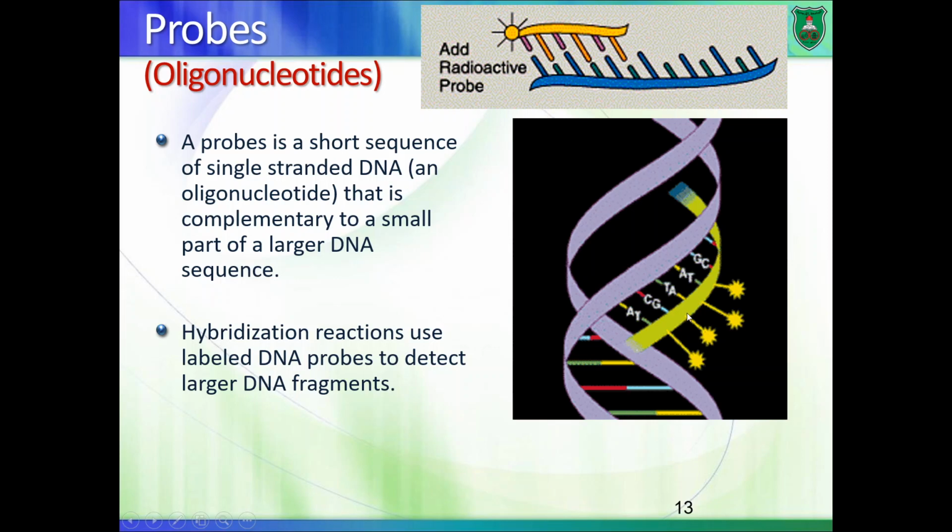And since, remember, we're not talking about a single probe molecule and a single DNA molecule here, we're talking about millions of DNA molecules of the same type, whether we're talking about the large DNA strand, or the short probes, the oligonucleotides.